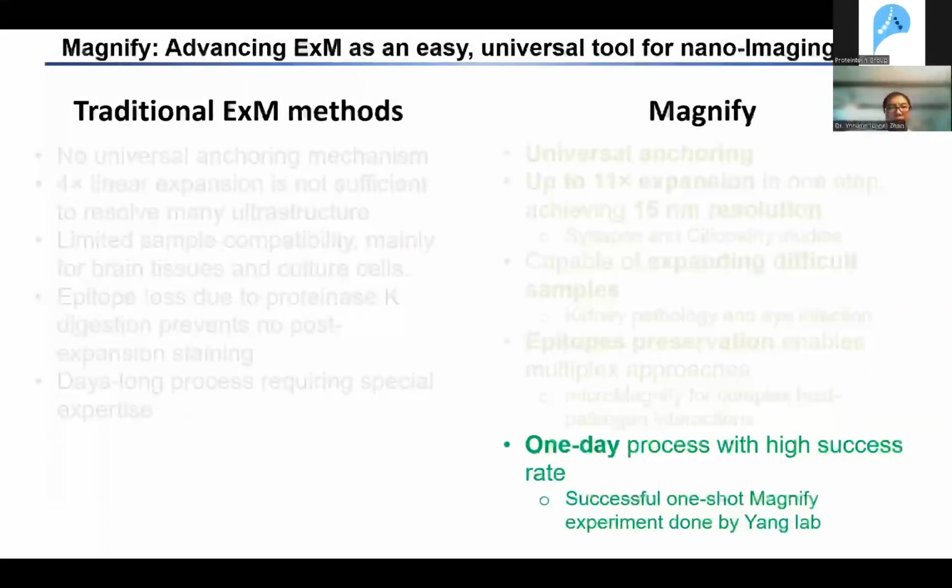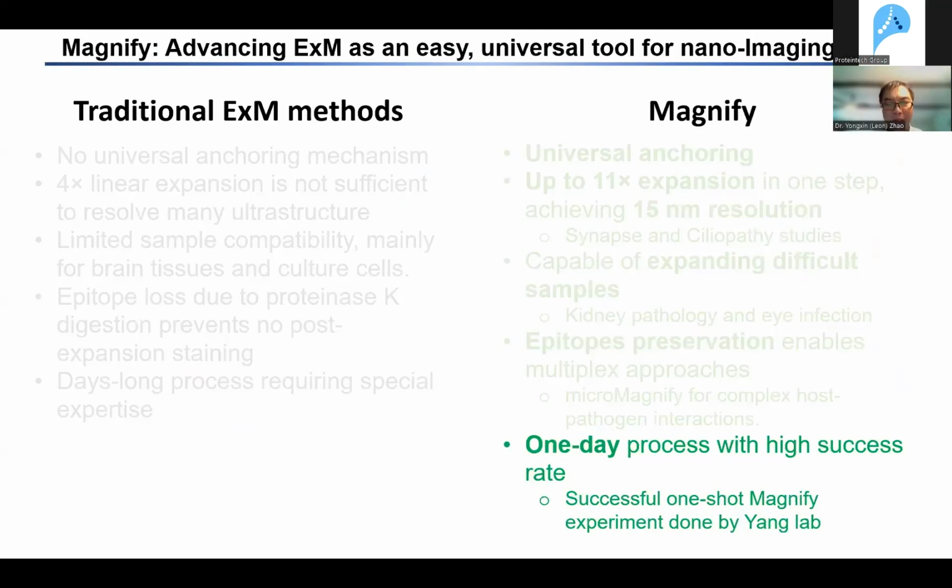Of course, I talk about all these features. Those are beautiful, this Magnify. That's great. But at the end of the day, we hope that Magnify could be used by any research lab, just like you, right? I hope that would be our mission, so we simplified the design of Magnify so that it can be done in a day. So I'm going to show you one example.